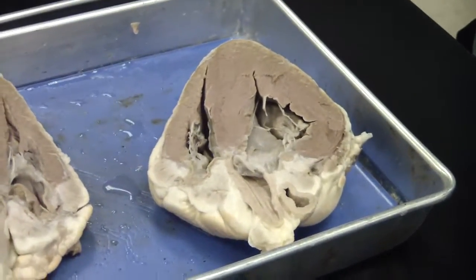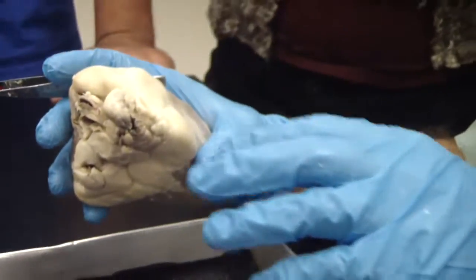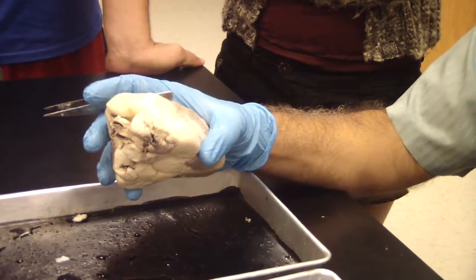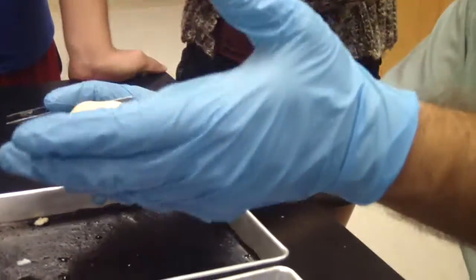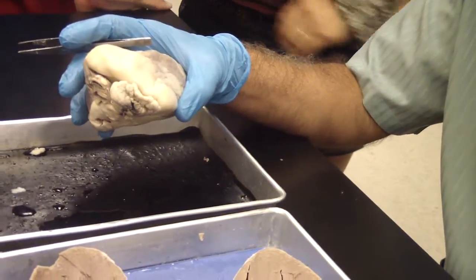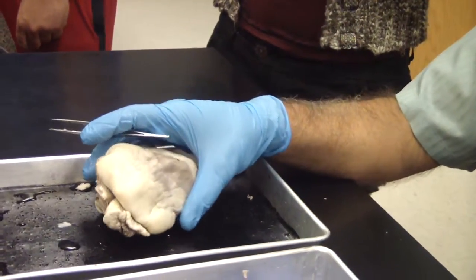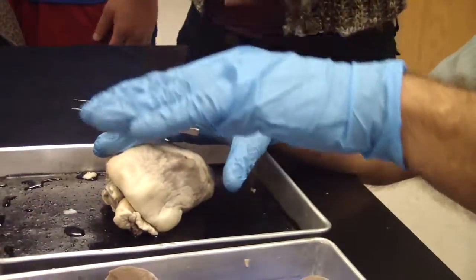Guys, first we're going to take a look at the heart from the outside. Make sure you look at page 450, the outside view first. Then once we finish the outside, we're going to open up and go inside, which is the page you already had before, okay?